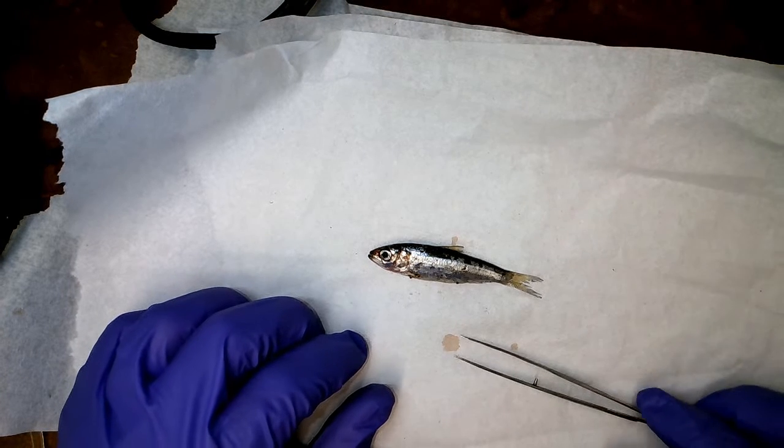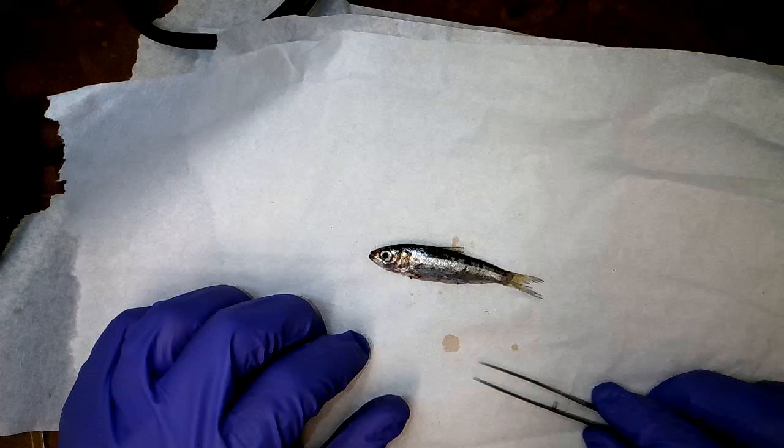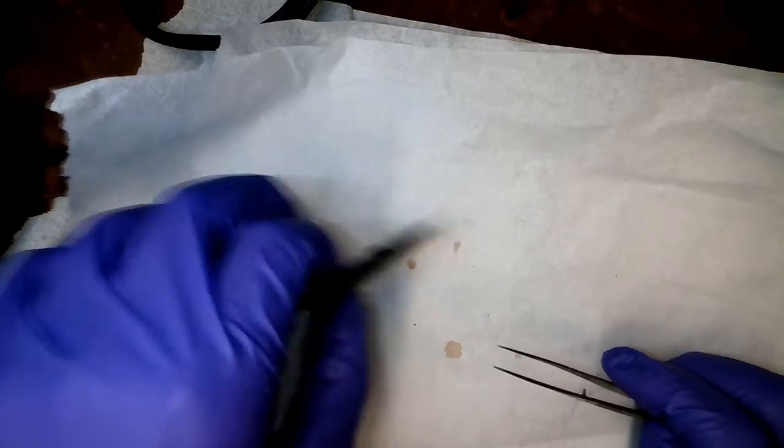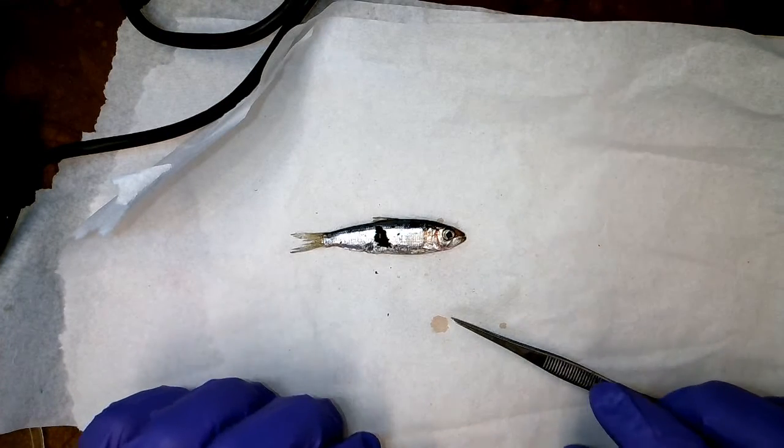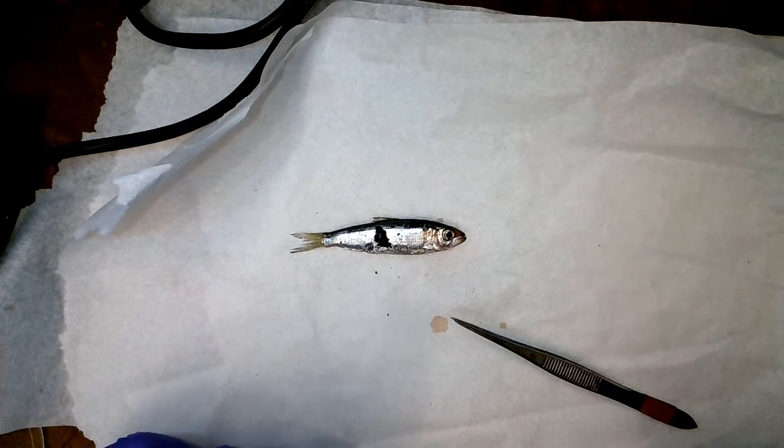Okay, 2. Again, asking about gill rakers, but more helpful, I think, it starts to get into questions about the lower jaw. So let's look at that. 2A, the lower jaw is strongly projecting, or 2B, the lower jaw is not projecting. So this may help to see what projecting and not projecting is.